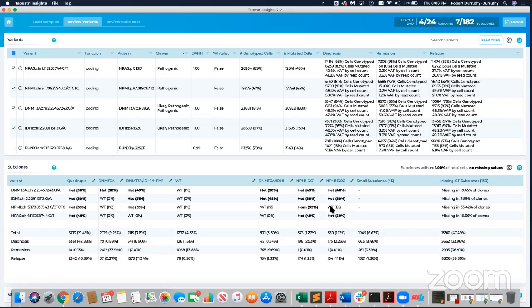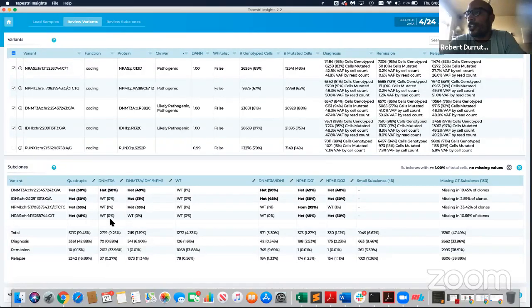Great. I think along a similar line, why isn't there ADO in the quad clone? So something maybe to point out: you will always have ADO, that's just a feature of single cell genomics, given the fact that you start with just 2 templates. Because we have a targeted approach, it is relatively small compared to whole genome amplification approaches, and so really the vast majority is below 1%.